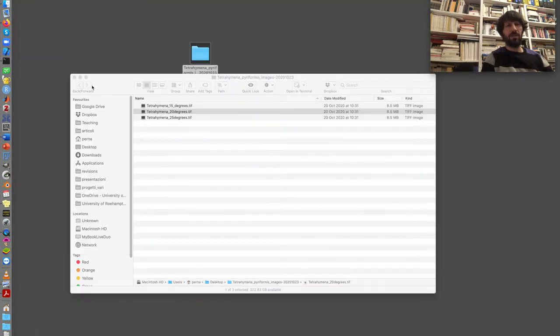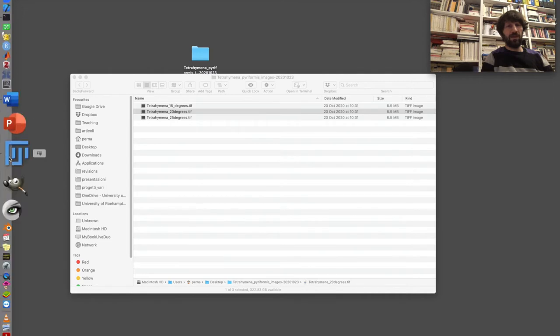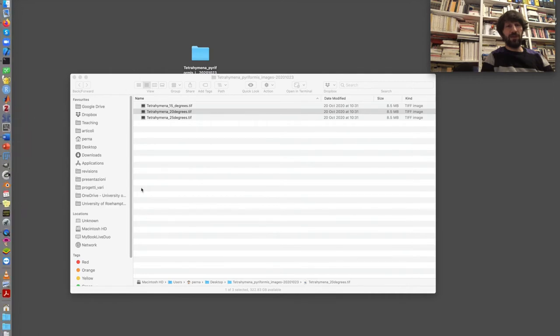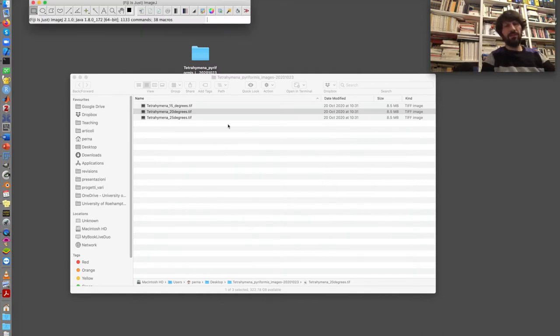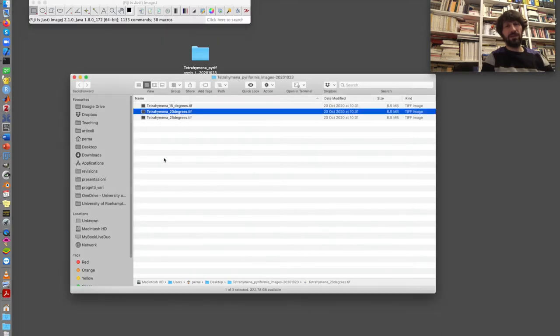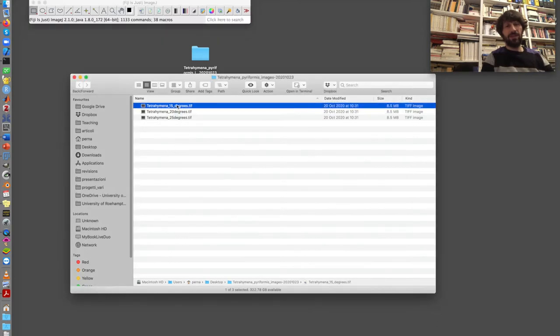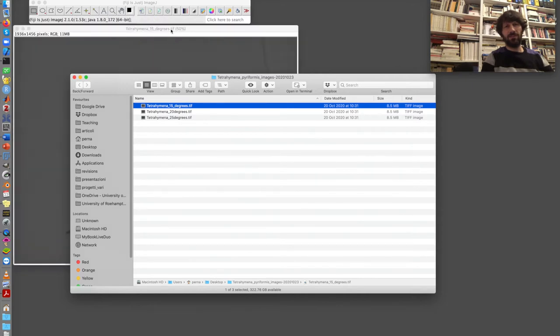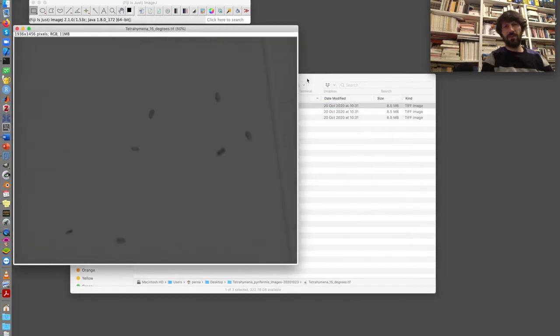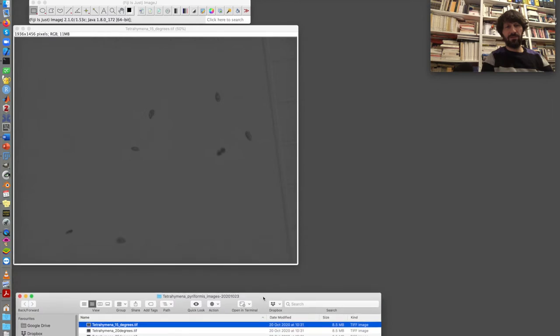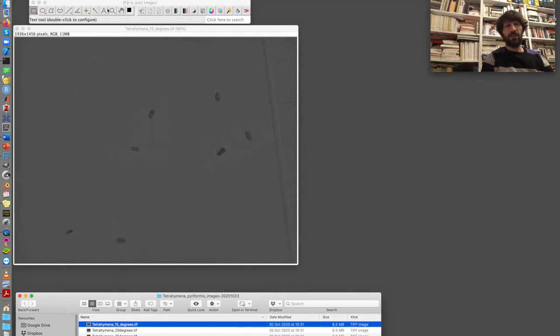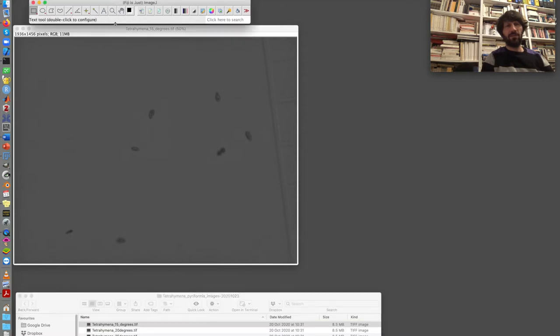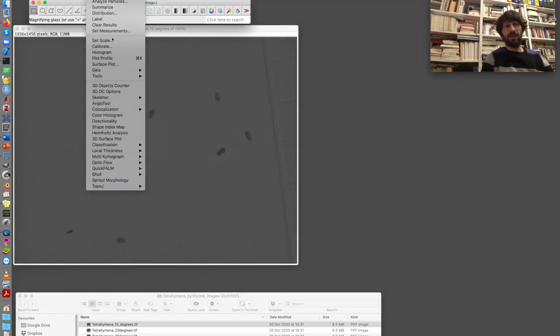Now I open Fiji here and my computer sometimes it might ask you to update it. In this case my version is already up to date. And I start by dragging and dropping the first image in Fiji. Here is the image. I move down the folder with the three images. You can clearly see the Tetrahymenas and the scale. Before I start doing anything I want to set the scale for the image. And so I go to the menu, analyze, set scale is where I want to go.